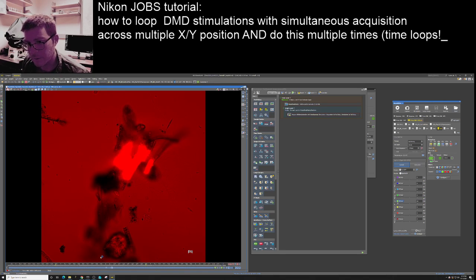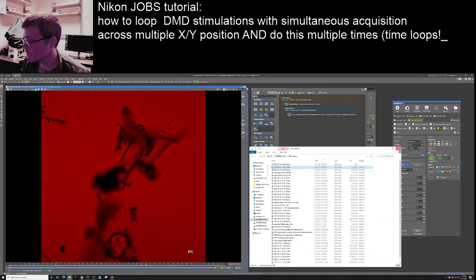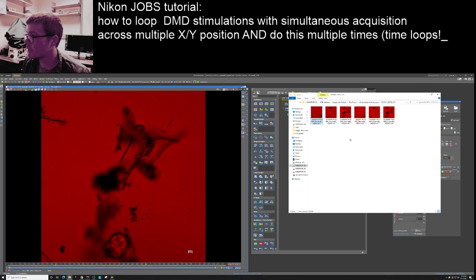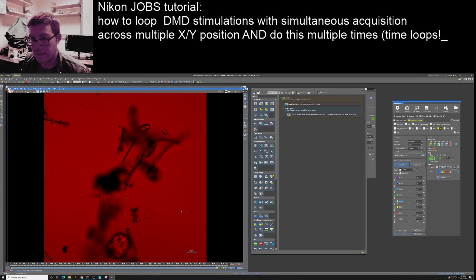I thought it would, but anyways, that's one of them, and we can, for example, look at how it behaved. Oops, wrong location. The same one.